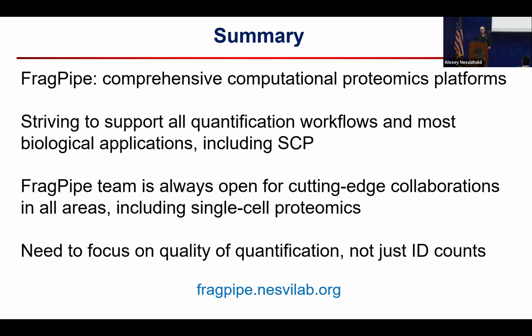So for single cell data, again, I think more optimization needs to be done, and things are improving really fast, and how you generate the data and the quality of data is changing. So I think it's still a moving target, but yes, we are always going through steps like this to see how we can improve the tools.